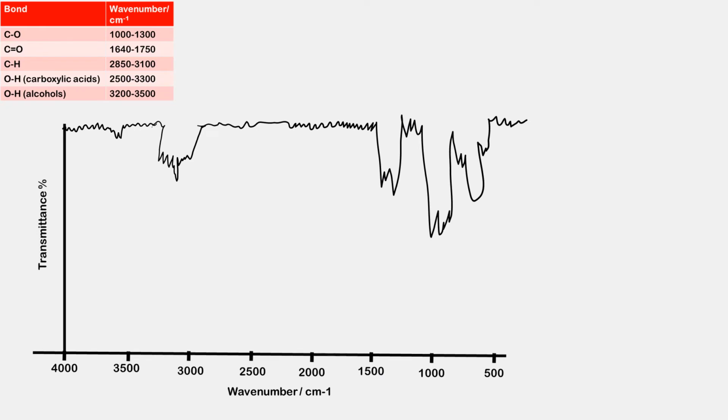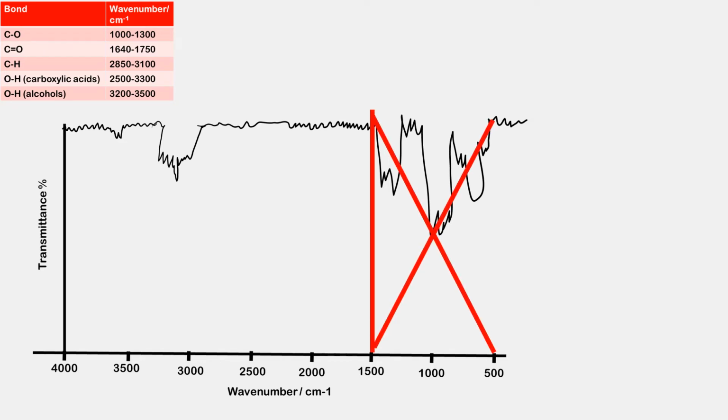Let's interpret the spectra. First, get rid of the stuff below 1500. That looks like everybody's Aunt Lorraine at the free bar of your distant cousin's wedding. A mess. Next, find some peaks.